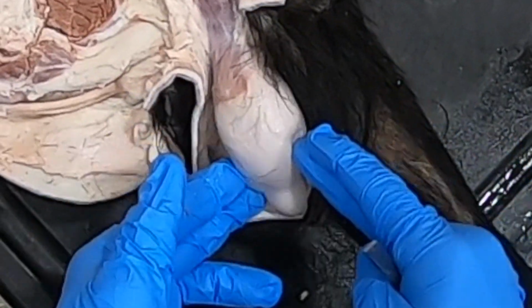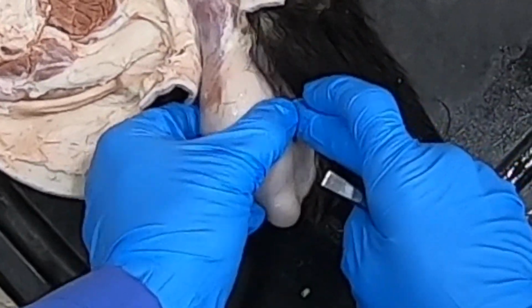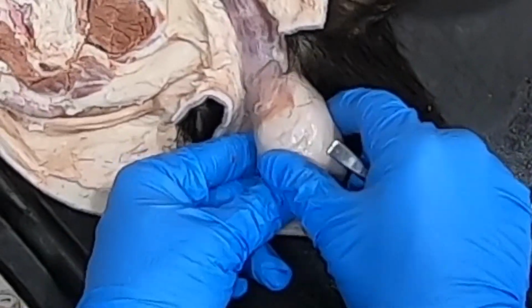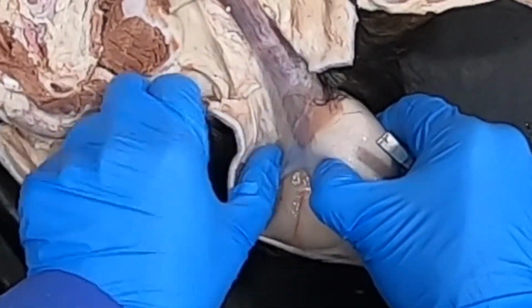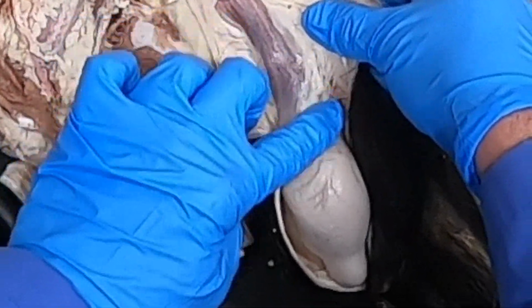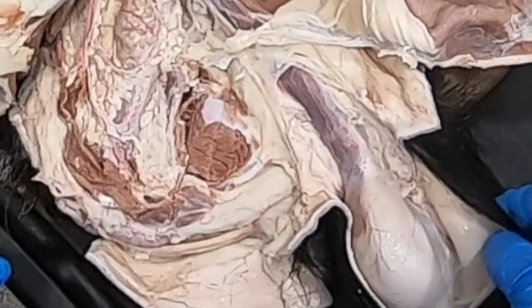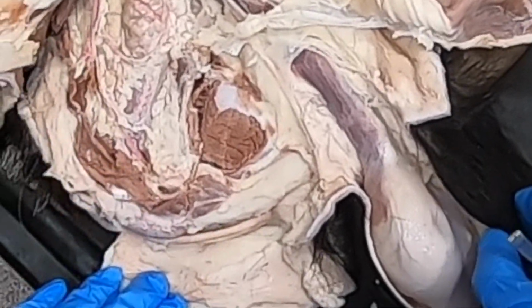And so this testis and epididymis is still within that vaginal tunic. And we'll open that up later to reveal that to you. Okay, so that's the cremaster muscle here. And we'll come back to this later, but this is really nice. I had to show you at this point what we got.